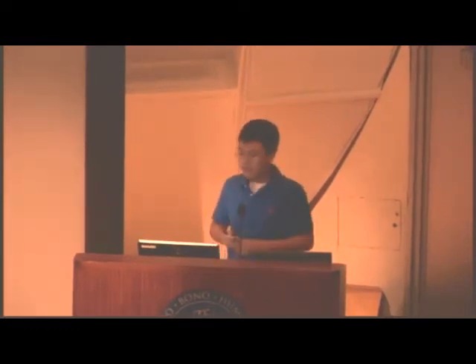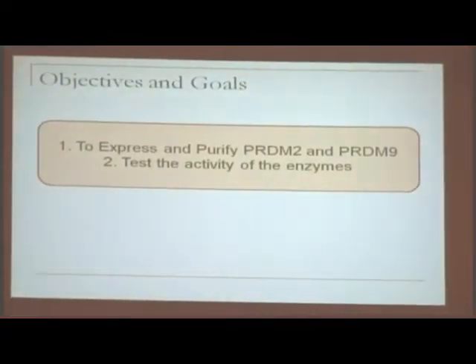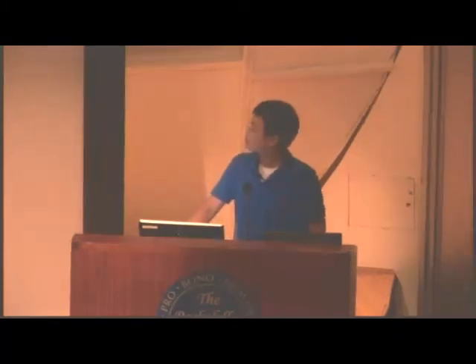So my objective and goal. Number 1, to express and purify PRDM2 and PRDM9. Number 2, to test the activity of the enzymes associated with such proteins. I've only been able to work on the first one, and I'll present that today.